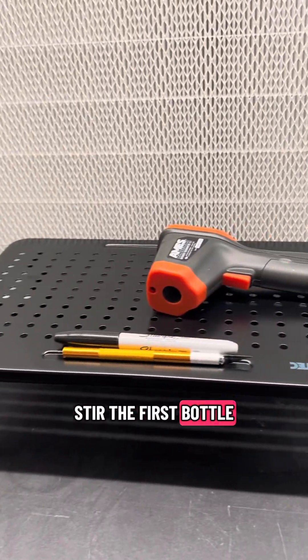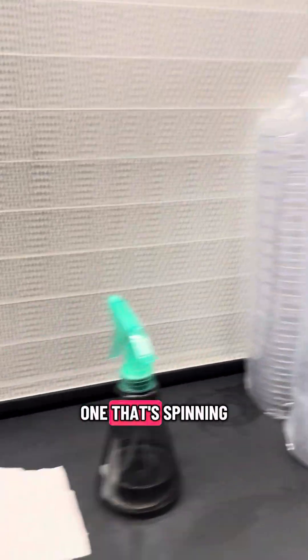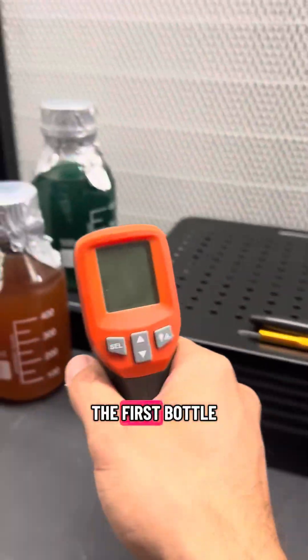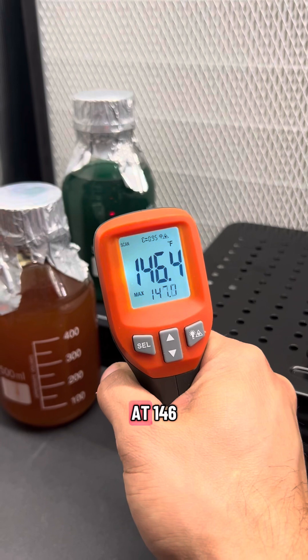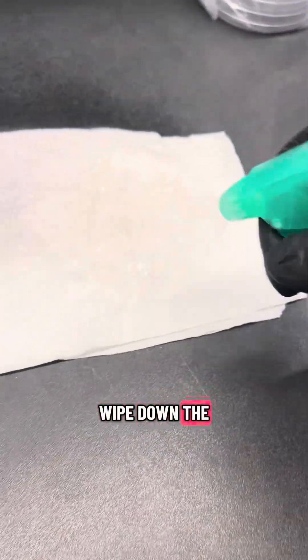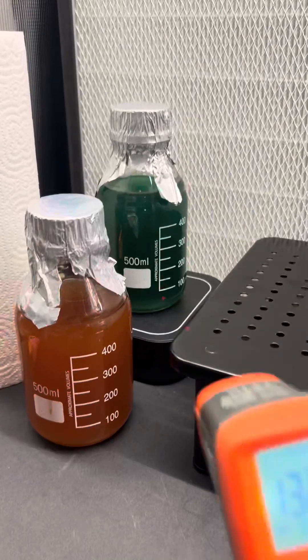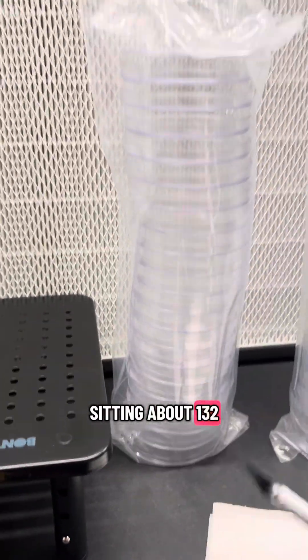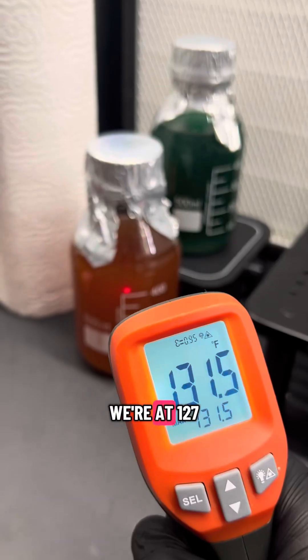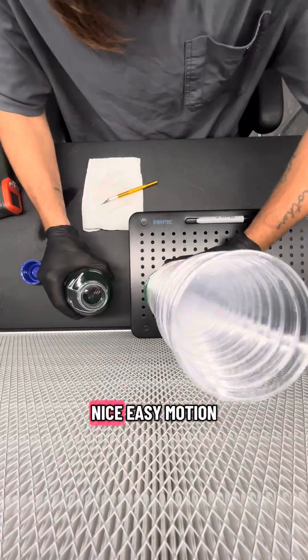We'll stir the first bottle and have the other one sitting behind it to cool slightly slower than the one spinning on the stir plate. We'll temp the first bottle — we're sitting at 146°F, the one behind it at 150°F, which is great. We're going to wipe down the outside of the petri dish package, and now we're sitting at about 132°F. Here's when I want to cut the bag open and get the plates set — we're at 127°F and 131°F, and that works for me.